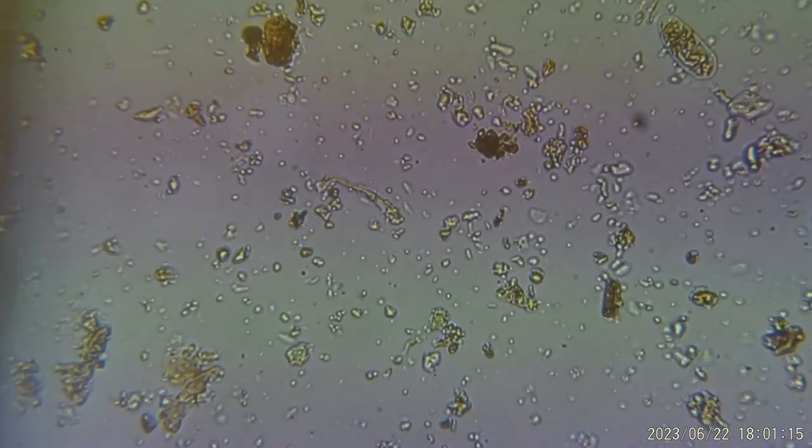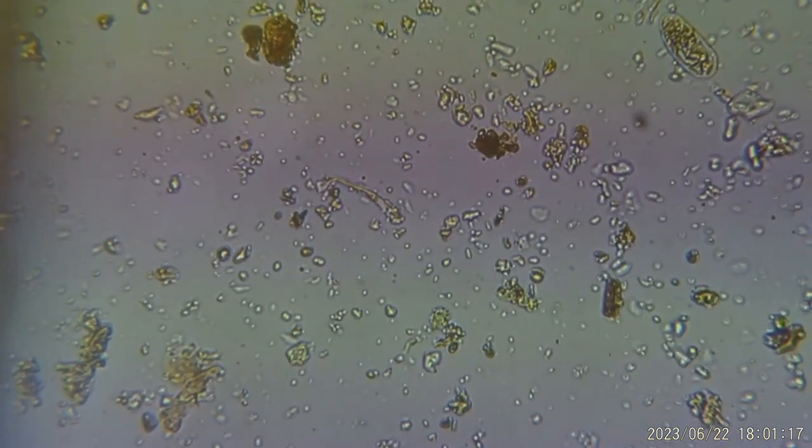Another thing you want to see is that you can see through your sample. You don't want to see the soil too dense, because all that means is that your sample is not holding itself together. Another thing I wanted to point out was this guy over here. That looks like an egg to me. I'm not sure what organism that belongs to, but it looks like an egg. It could be a nematode egg. Anything else in there, guys, that you can see that looks interesting?